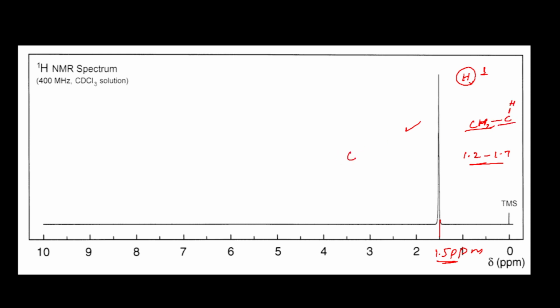So this also tells you that your CH2 group is present, as your molecular formula is C5H10, and only one kind of the protons are present. So it means the integration value here is 10. It means that there are 10 protons. Okay, now we will see that only CH2 groups are present, right? Because the information that you get from the carbon 13 is that CH2 group is present, and from the proton NMR it is also that CH2 is present. And why did I say that 5 CH2 groups are present? Because the molecular formula is C5H10, and we have to divide this formula to make this structure.